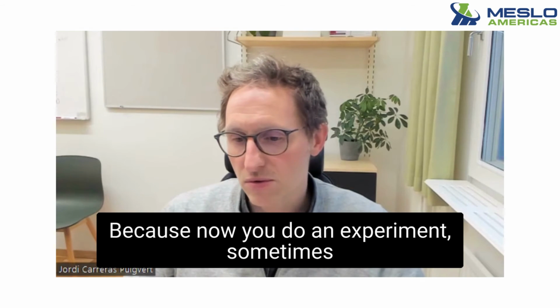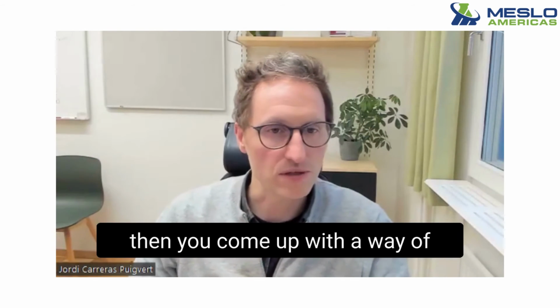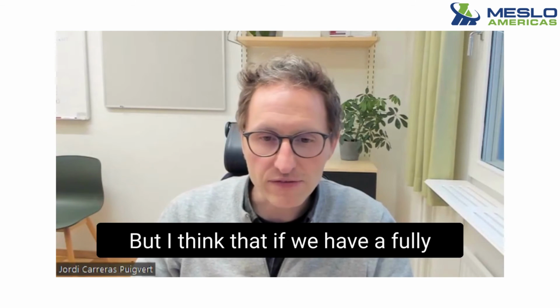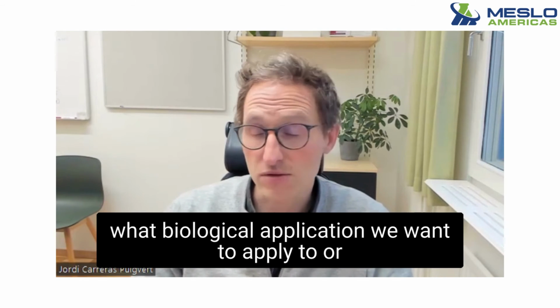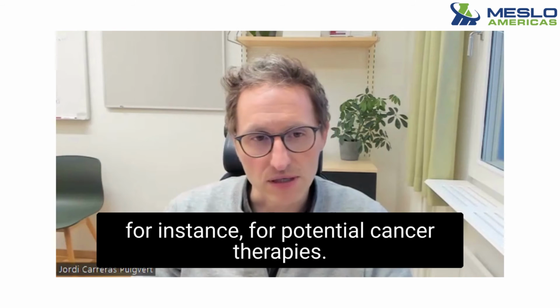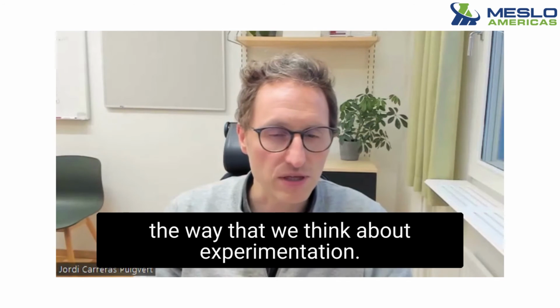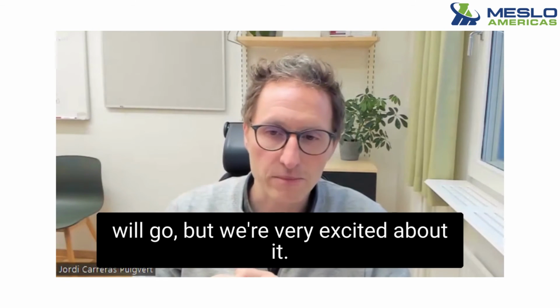Because now, you do an experiment. Sometimes you expect a certain result, so you assess it in a certain way, right? And if it doesn't come out, you want to validate it, and you come up with an orthogonal assay or something to validate that result. But if we have a fully autonomous lab, we need to think very carefully about what biological application we want to apply it to, or what biological question we want to answer. We're thinking about drug combinations, for instance, for potential cancer therapies. I think this will revolutionize the way that we think about experimentation. It's pretty exciting. It's very difficult. We don't know entirely how the whole procedure will go, but we're very excited about it.